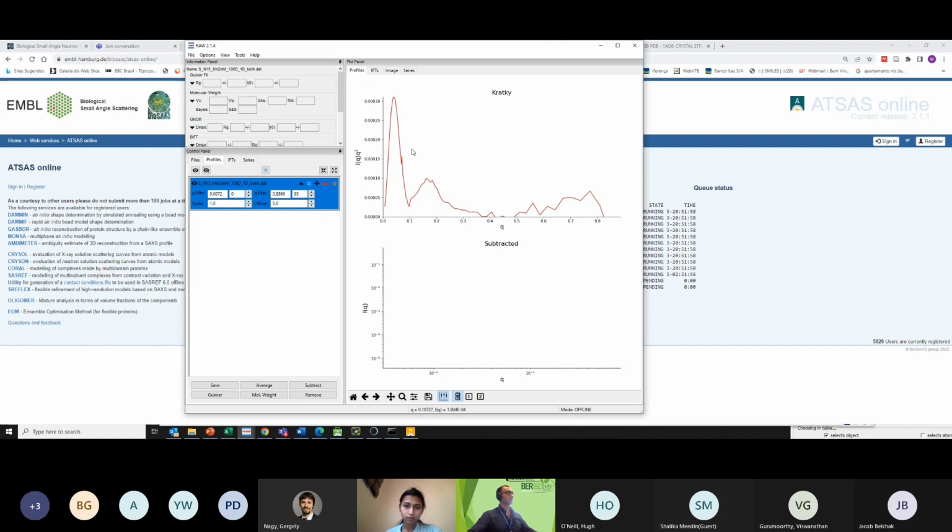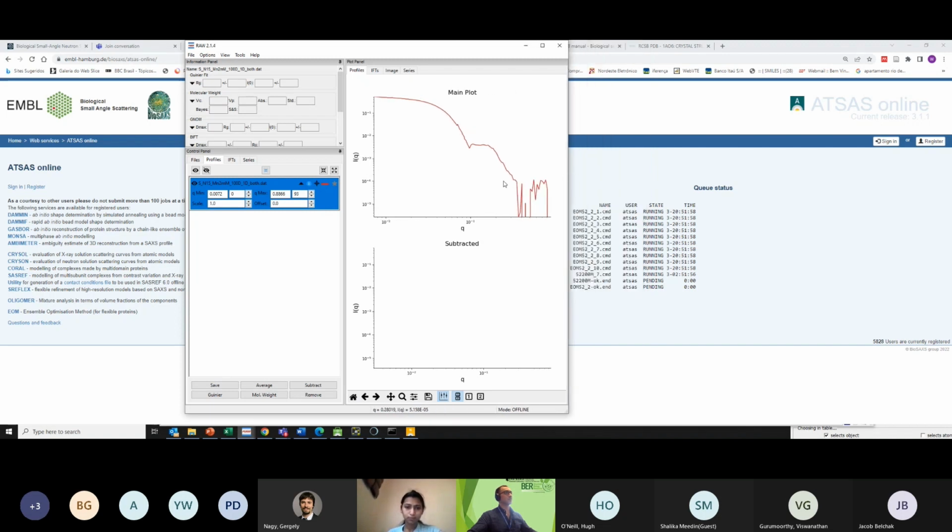So you see the shape of the Kratky plot, right? You have the main peak and you have a secondary peak there. I think you should show the log-log. Yeah, there's your scattering data. Here's my scattering data. I have oscillation there on the high Q regime. These oscillations deviate from the Q to the minus 4, which is this regime here.